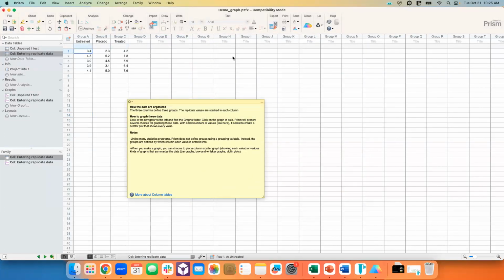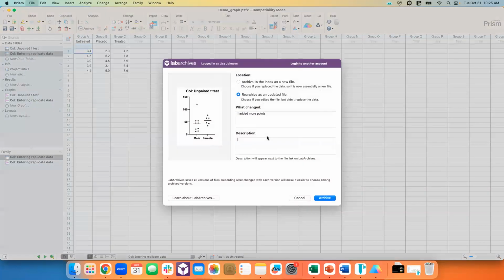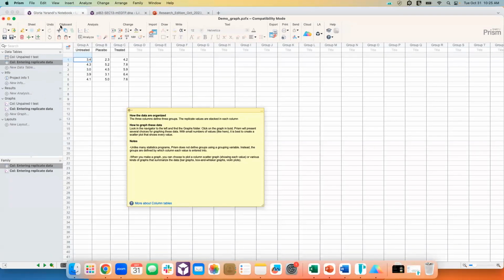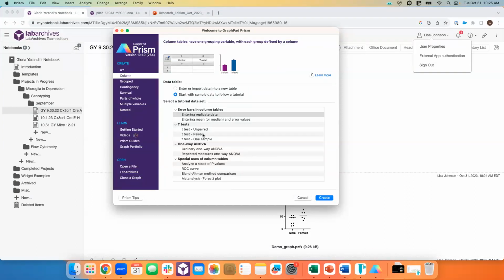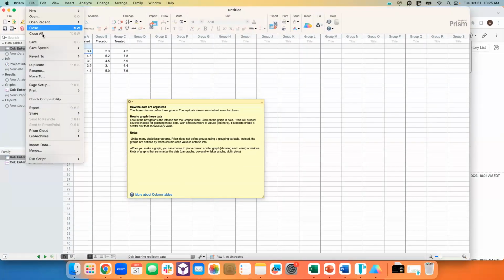Okay, and after I save this Prism file to my laptop, oh, let me hold a second. Okay, perfect.